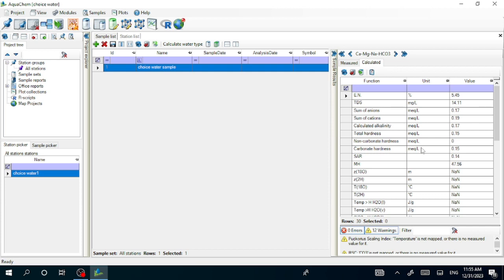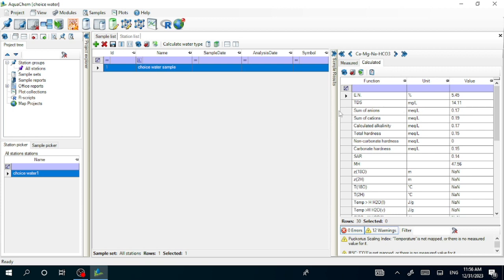Once you get this value, the water type is displayed. Based on the data, this is a Calcium-Magnesium-Sodium Bicarbonate water type. Let us now see this on the plot.